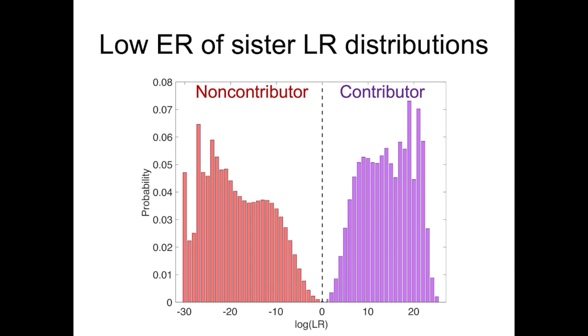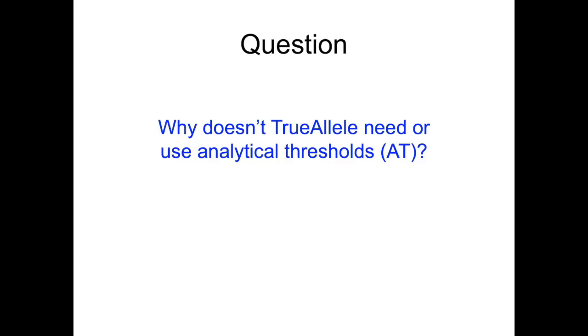By understanding these distributions and error rates, and when they're low, that's what makes results more reliable. You can validate from any genotype. You don't need anything special. Many of the labs have validated from casework. It's not clear that everybody understands this yet, but you do. Or if you don't, you'll have questions that we'll answer. Okay, next.